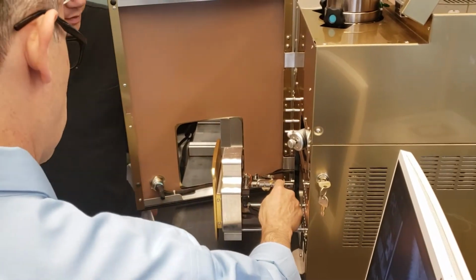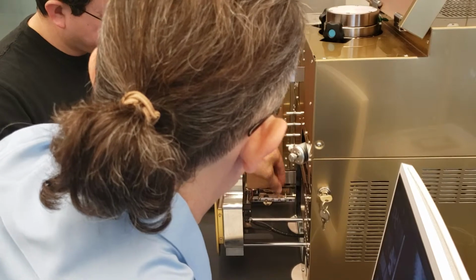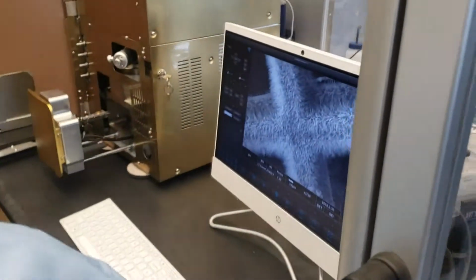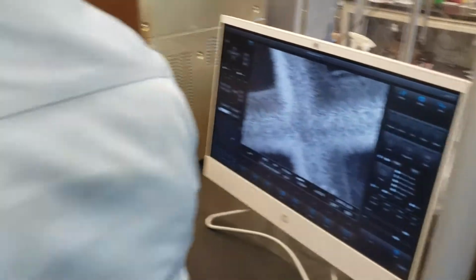And you can see the carousel has 1, 2, 3 holes in it, right? So you can put the sample wherever you want to put it. There's another sample over here. I can remove it, I can put it there, I can put it wherever I want. And if I take a look at my microscope stage program, you see there's a carousel, carousel, and carousel, right? 3 carousels, 1, 2, 3.